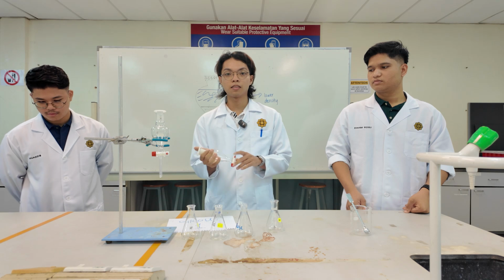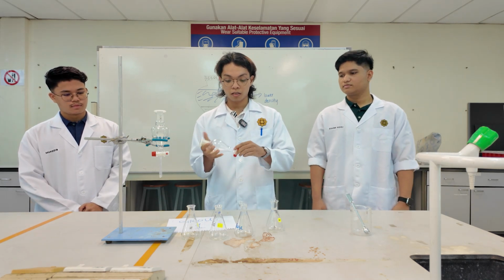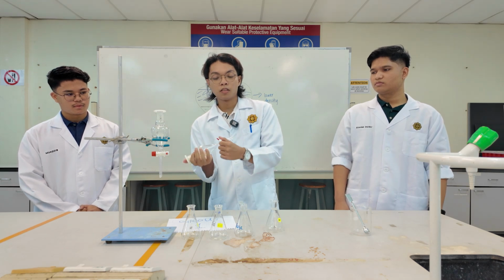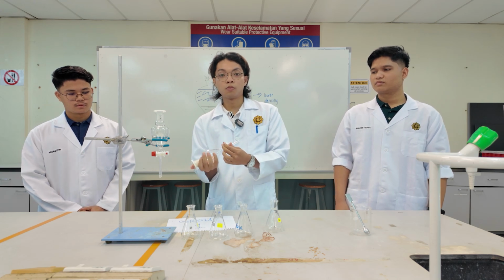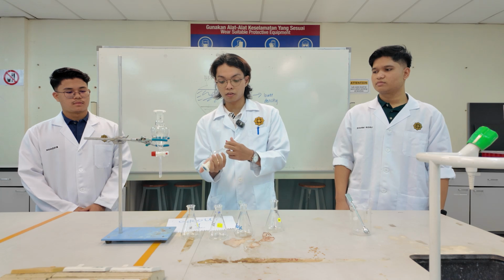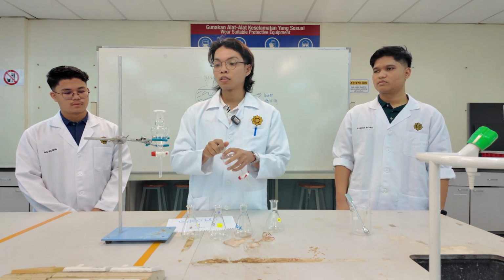It's still the same as the first part. You need to shake, and then after that, you need to open the stopcock to release the pressure slowly, and it will produce a hissing sound. So after it stops, you can transfer to this funnel.